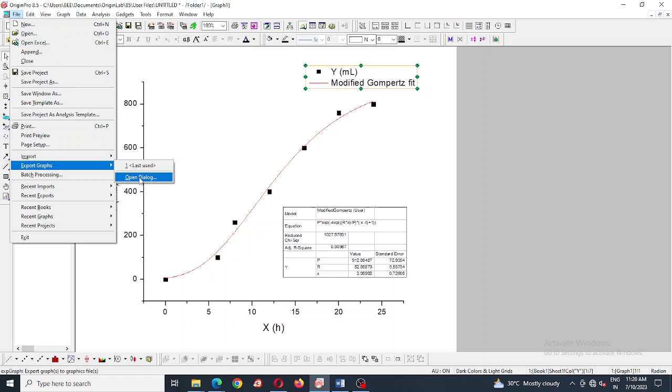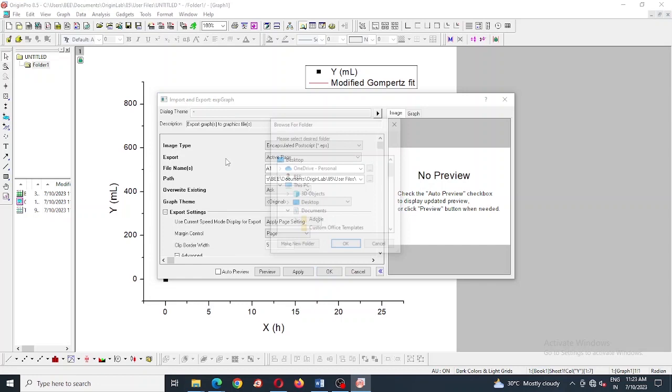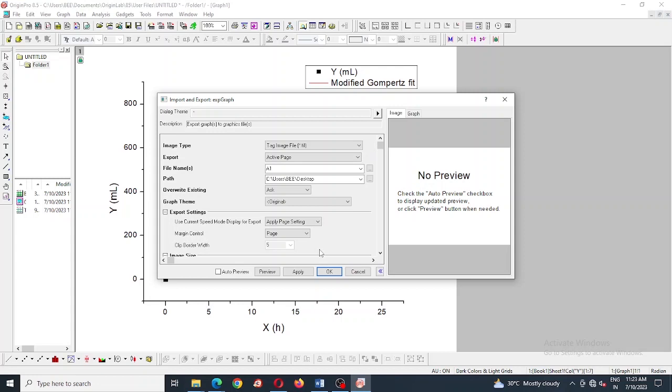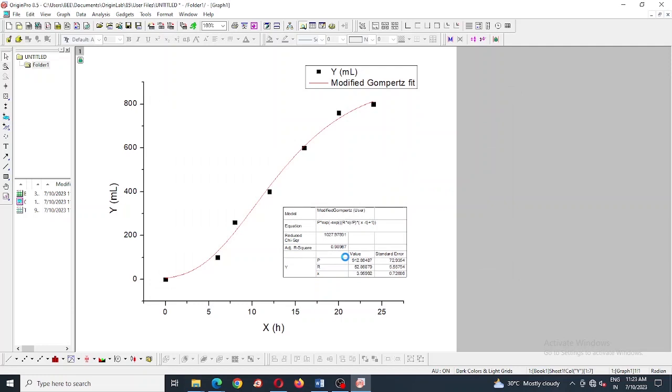Here image type should be chosen which is EPS, and then file name where to save and what is the DPI resolution. DPI resolution is in the export setting tab. Here you can set to 600 or 1200 for good picture.